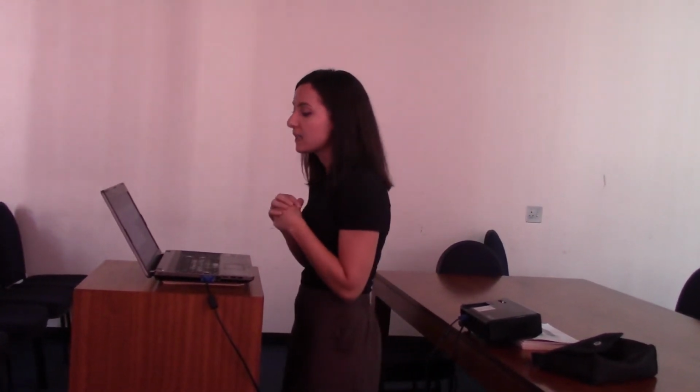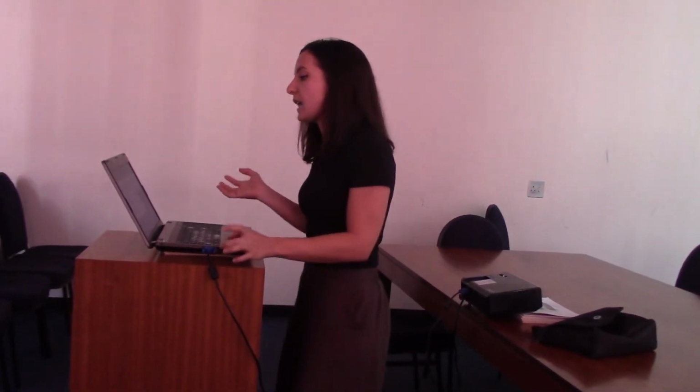So I want to briefly talk about the next level of RNA-seq, which is now single-cell RNA-seq. Some people already in this department are looking at single-cell RNA-seq analysis. With bulk sequencing with RNA-seq, we are taking the average expression profile for all the cells in our sample. The problem is that there's a lot of heterogeneity. If we are looking at this bulk population of cells, there could be individual cells that are having a real effect and a real change, but because we're looking at the average, we're going to fail to identify that change.